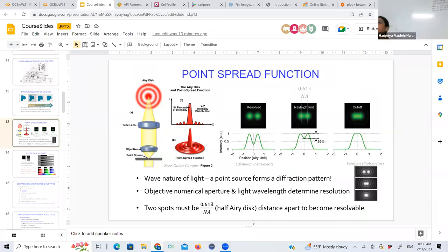diffraction threshold? Independent of that, because the diffraction limit is just set by the physics of our universe and the wavelength of light you're using. Nothing you can do about that. Whereas when you say a good quality camera, there are a few other properties that you look for. For example, you don't want your pixels to be so big that you can't even get to diffraction limited. You want them to be at least a reasonable size.